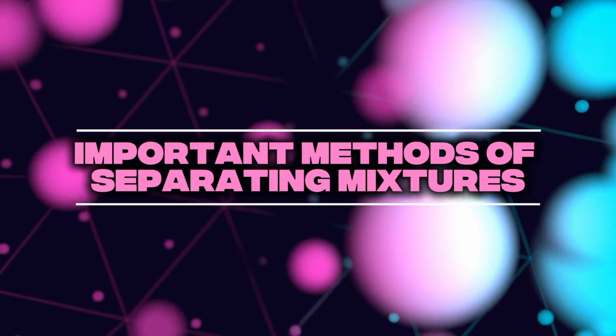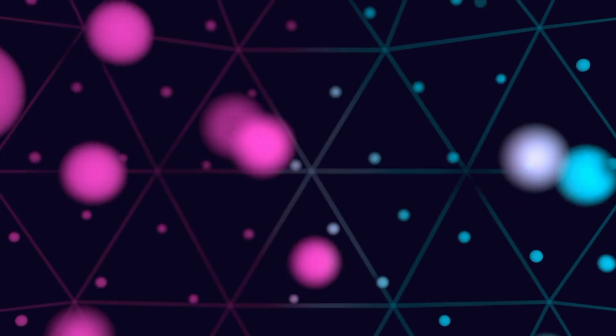Welcome to our inorganic experiment video. Today, we're going to demonstrate two simple but important methods of separating mixtures: evaporation and sieving.